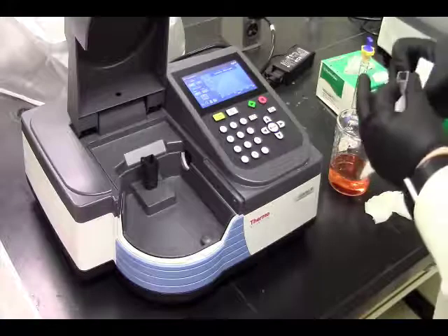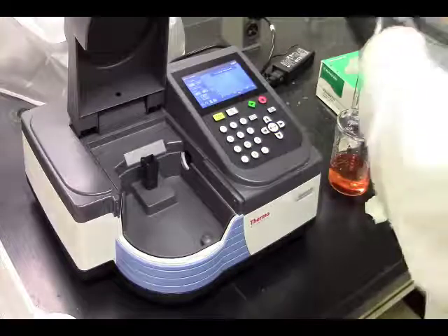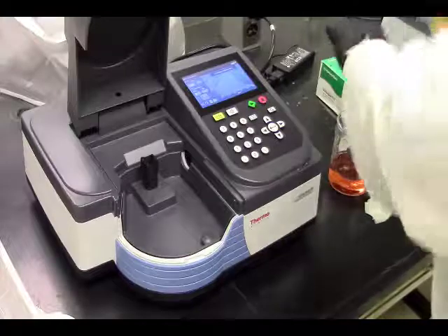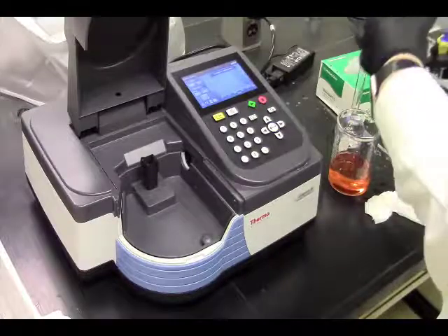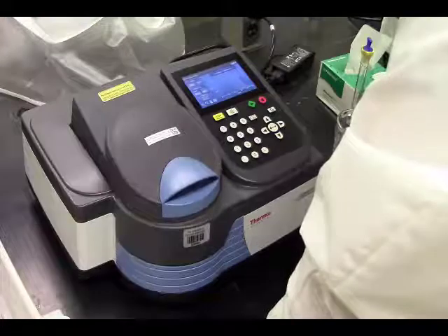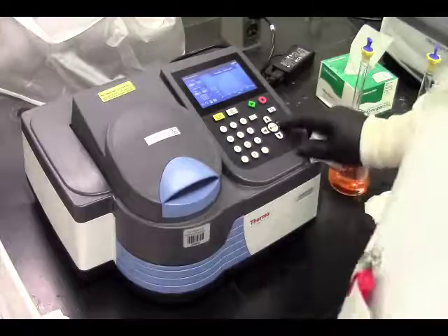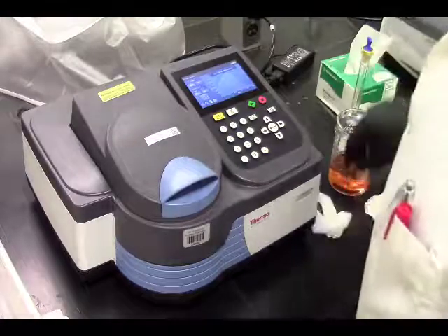Now, since I'm still not absolutely sure about my other one, we're going to move into our unknown. We're just going to do several rinses. Three times is the magic number for any analytical process that you're doing. Rinse this 3 times. Pop it in. And let's get a reading. At 510. Same nanometers for everything. Same wavelength. This is 0.147.